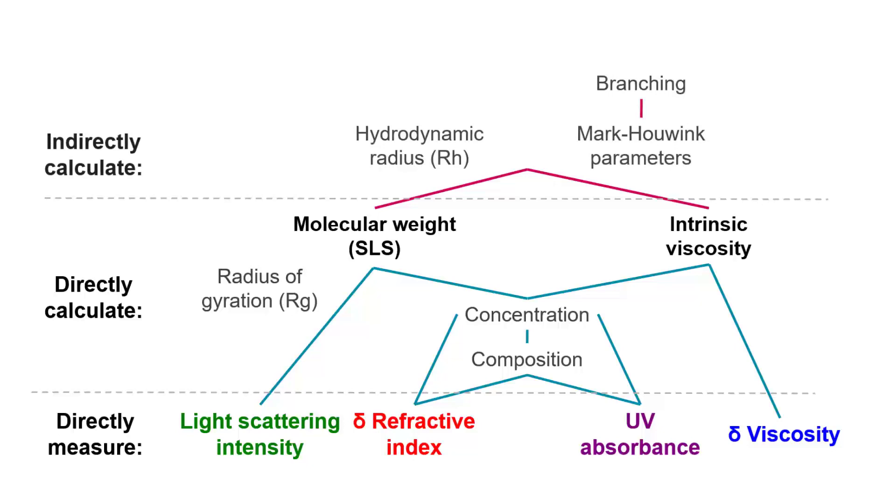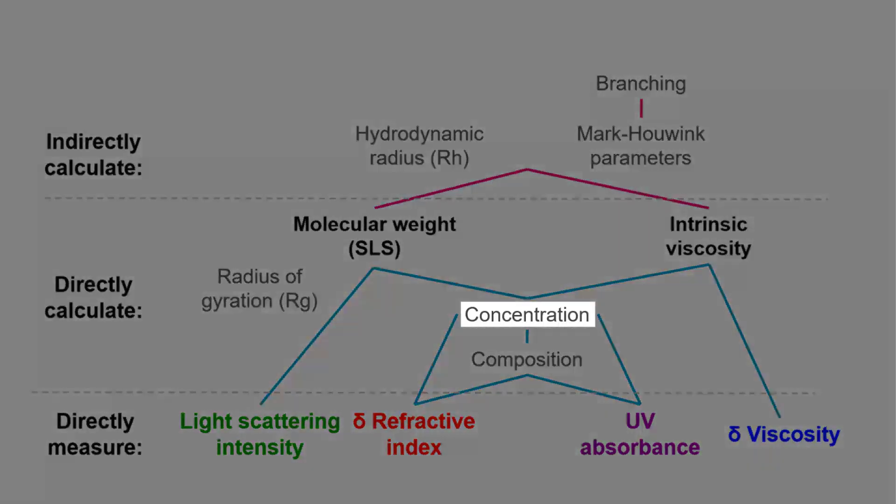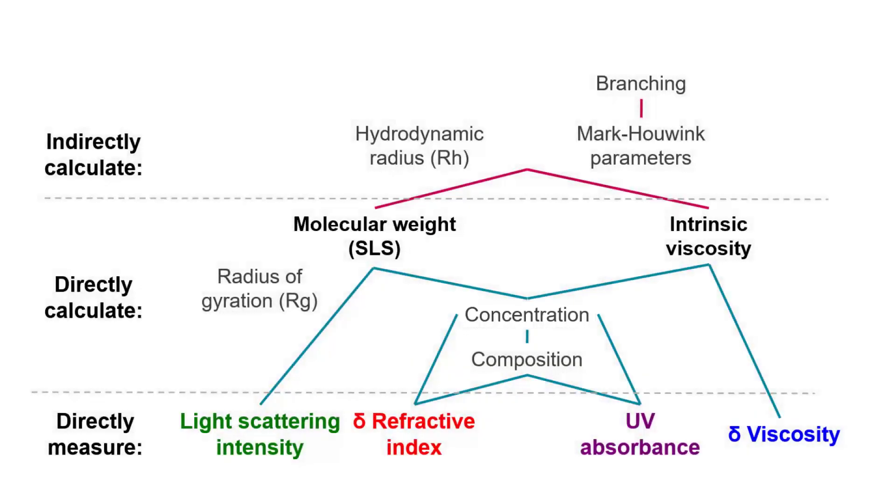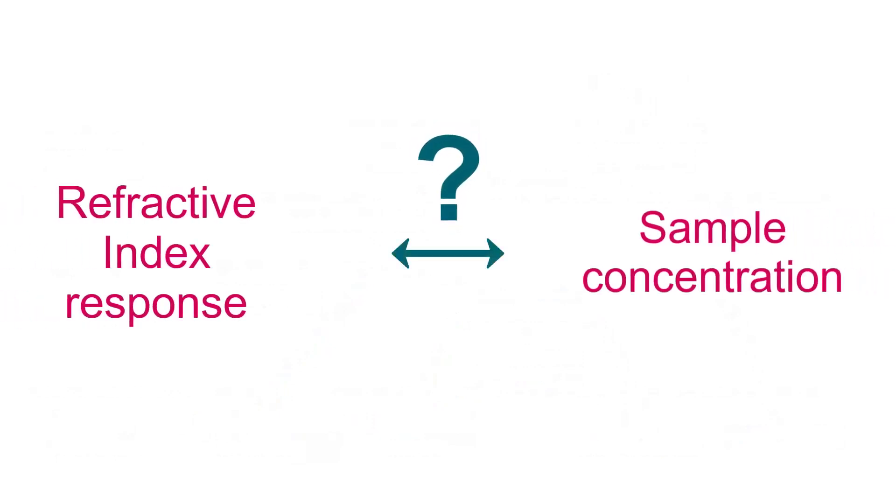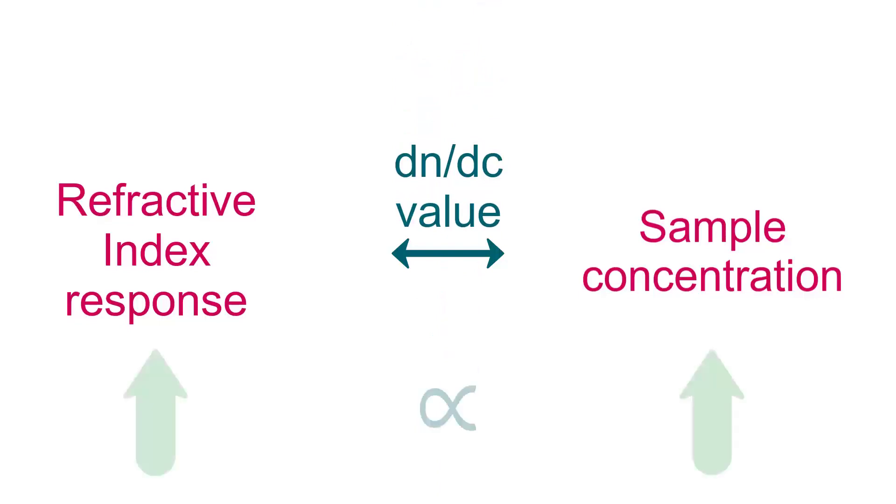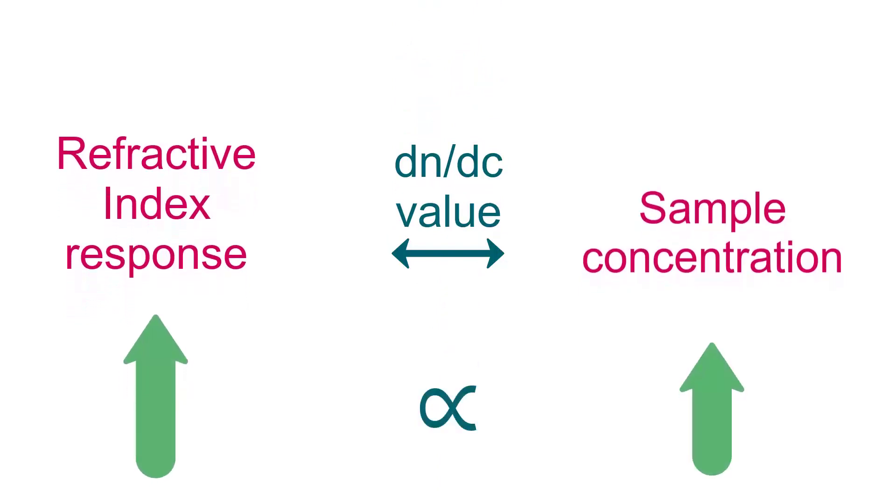These calculations all rely on knowing the concentration of the sample at each data slice. To determine concentration, the observed refractive index response is combined with the sample's DNDC value, which describes the change in refractive index response with respect to change in sample concentration.